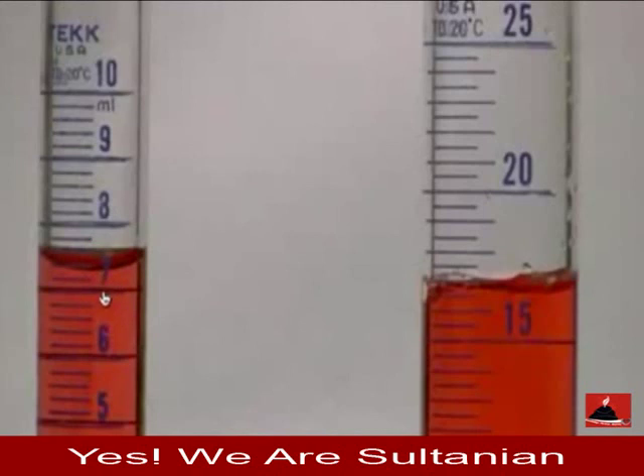If you said 7.4, that's not bad — that's acceptable.